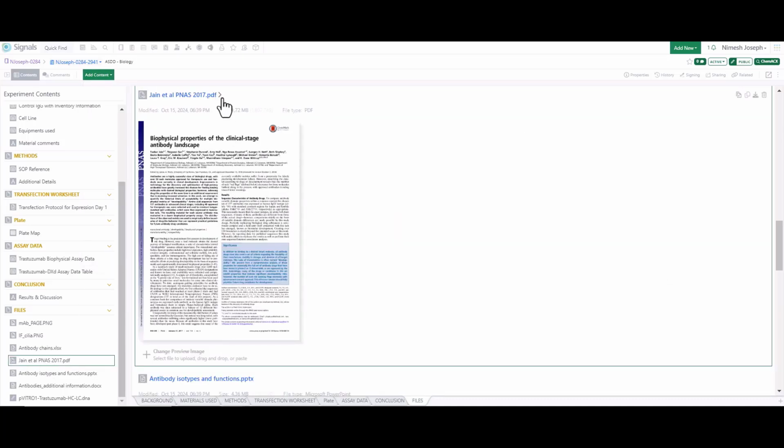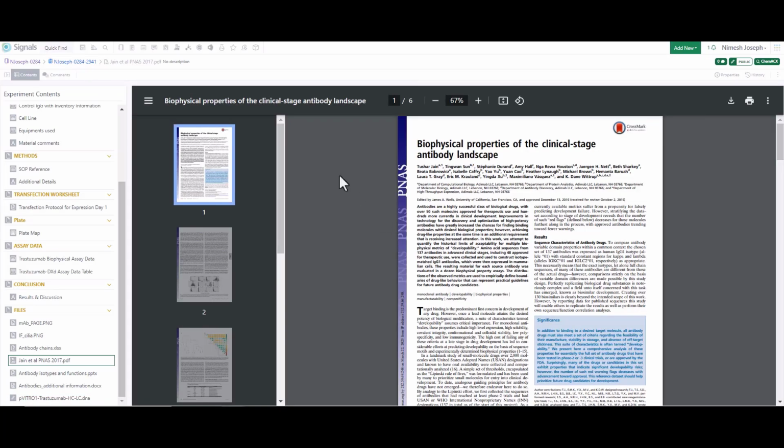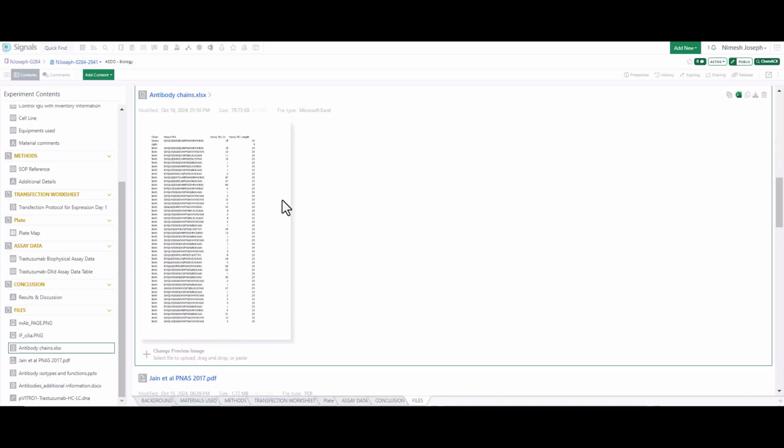Clicking on the file itself, you can see a preview. If you would like to read the file in more detail and clarity, you can expand the file and you can read. If you would like to download, the option is available to you as well. Any edits that you do to the file will be captured in the audit trail. You can edit a file by clicking on Edit in Excel Desktop application or Excel Web.